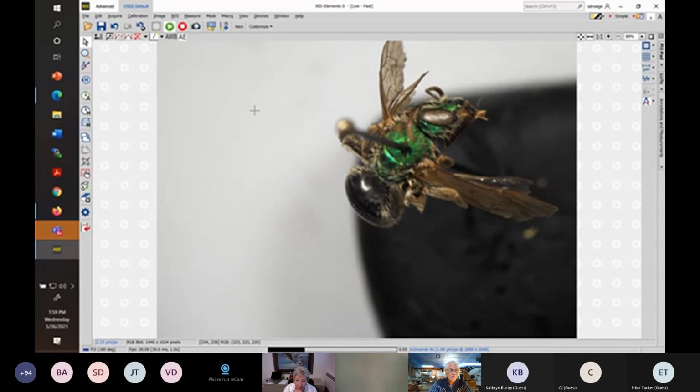Augochlorella aurata is the most commonly captured thing in our database, but Augochlora pura is also right in there. So we'll show you a bunch of shortcuts for IDing those that are not even really mentioned in the guide, but are useful to go through quickly. So I'm going to say, yes, if you had a male, you would get to an answer, even though that particular character is just for females. Does that make sense? Thank you.